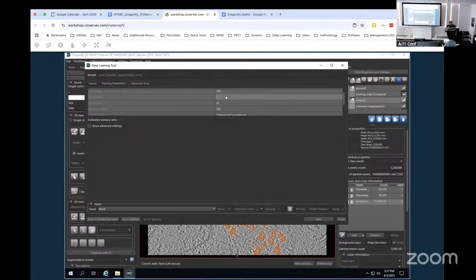I don't know that you're gonna be able to help, but maybe you can help them try to figure this out. It won't show the bottom, like if they go to train, and there's no scroll bar. Yeah, it's because it's inside the window. Okay. It's like inside maybe.